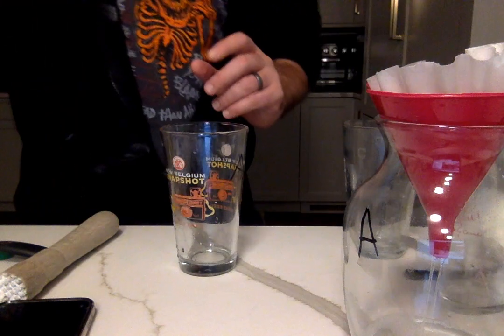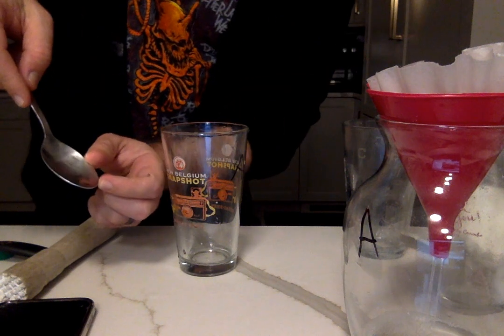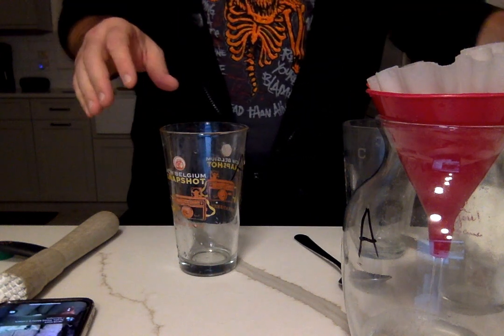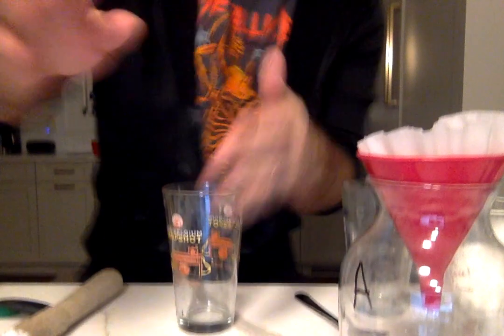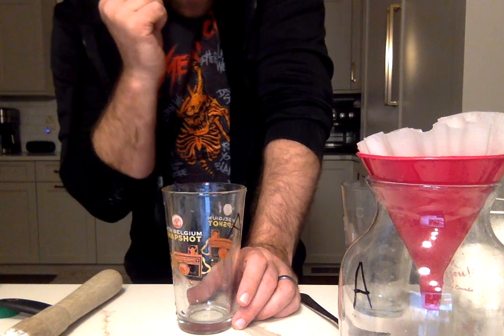For solution B, I'm going to use cornstarch, and I only need a little bit of it, about the tip of a teaspoon or tablespoon right here. Pour it in there, and then I'm going to use about 350 milliliters of distilled water. The thing about this is it's a very concentrated solution. I've been stirring it up, for like 2 minutes on one of the videos.